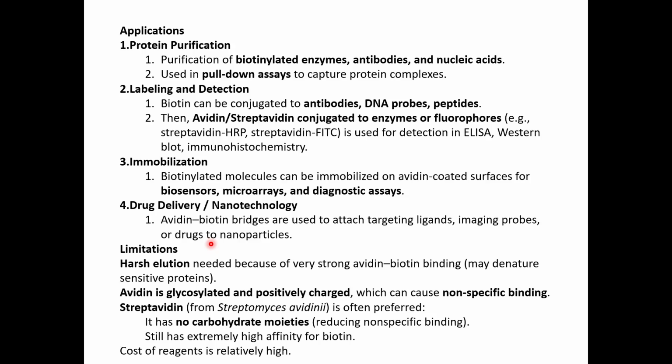So you need really harsh changes in the pH or any solution buffer conditions so that you can break the bond. So this, like we discussed, may sometimes become problematic to your protein of interest, your target of interest, if they are sensitive proteins.